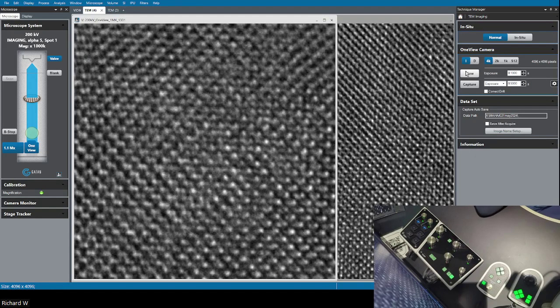Good question. I think we wouldn't be able to answer that question without careful comparison to simulations. You can see on the left-hand side here that we have these kind of dumbbell effects. And I suspect that in this area, due to the thickness, the atoms are dark.